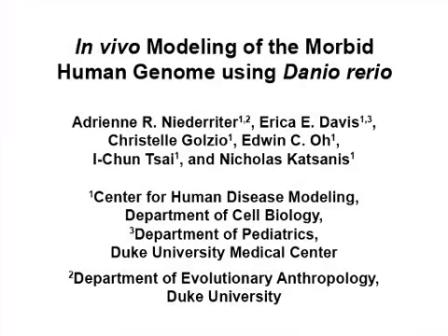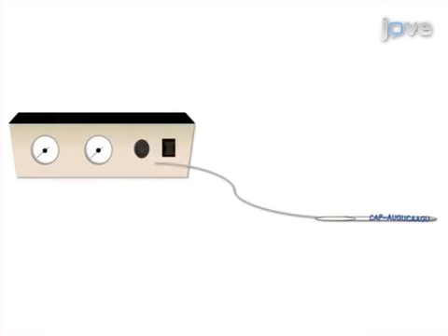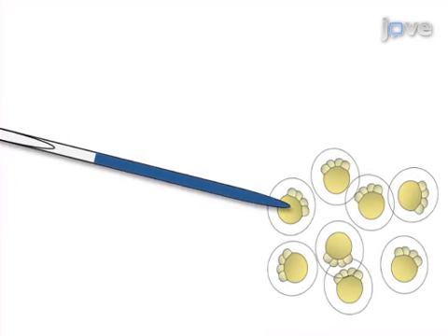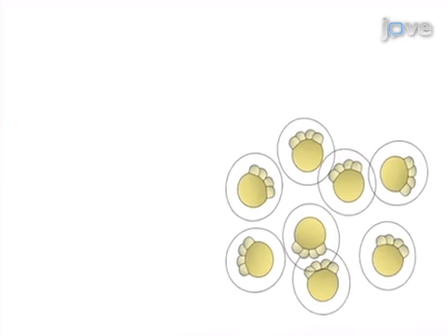The overall goal of the following experiment is to assay the pathogenicity of clinically significant non-synonymous changes using in vivo complementation in zebrafish. This is achieved by first generating mutant human mRNA to recapitulate human genetic lesions. Next, human wild-type and mutant mRNA and morpholinos are injected into zebrafish embryos and translated into functional protein or used to block translation, respectively.